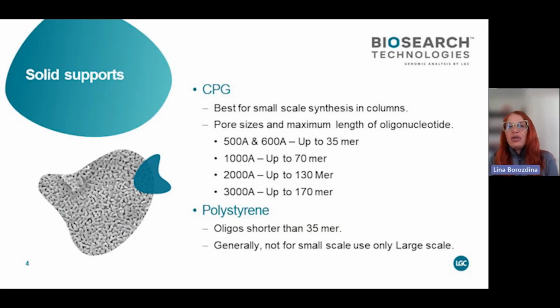What is CPG, or controlled pore glass? It's a little shard of glass. It's non-swellable. It does have little grooves in it. This is part of the process to increase the surface area. The grooves come in different widths, so they call it the pore size.